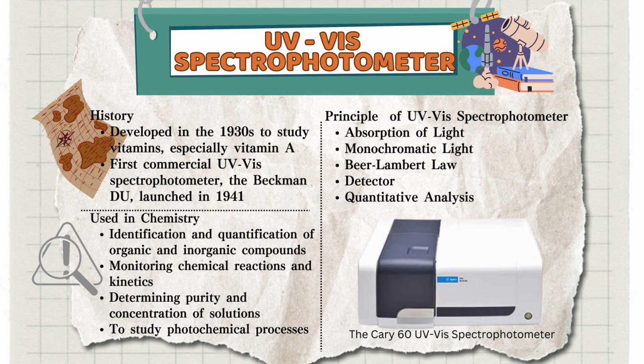It is also used for monitoring chemical reactions and kinetics, and also to determine the purity and the concentration of a solution. The last use is to study photochemical processes.